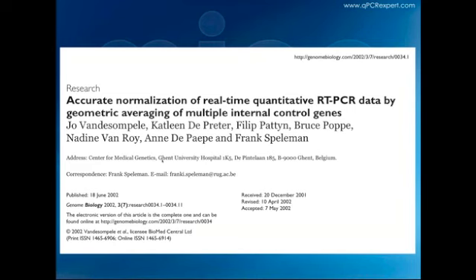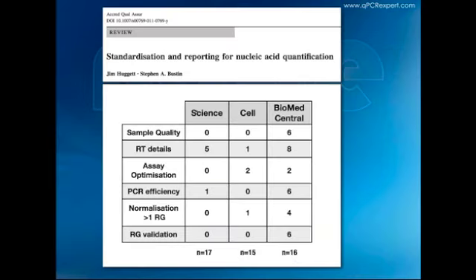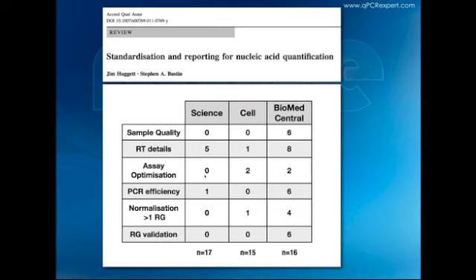Even today, this is not universally practiced. We published a small paper last year looking at papers published in Science in 2010, Cell, and BioMed Central journals, examining quality parameters essential for judging qPCR paper quality. Not a single paper in Science or Cell out of 17 and 15 papers respectively looked at RNA quality. Assay optimization is something people just don't do. Most people don't look at PCR efficiency, and even in BMC journals it's less than 50%. And very few people use more than one reference gene for normalization.